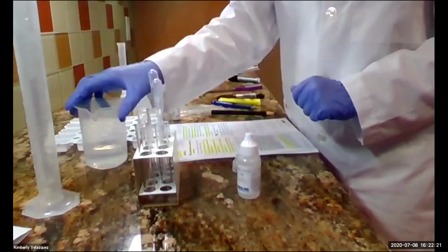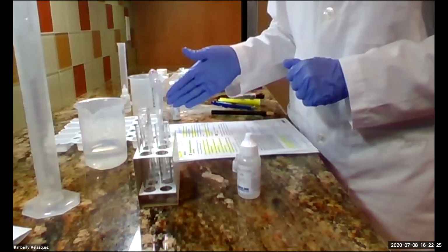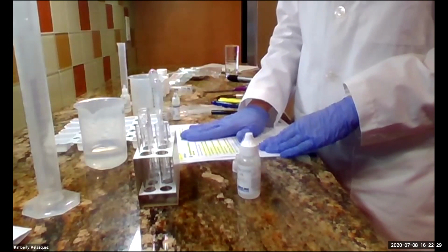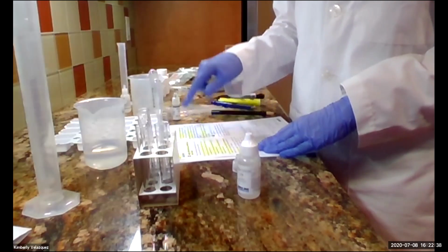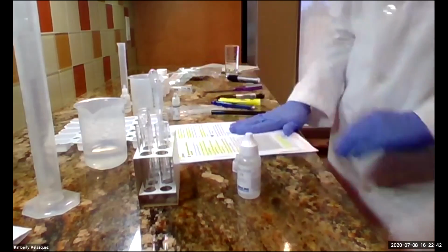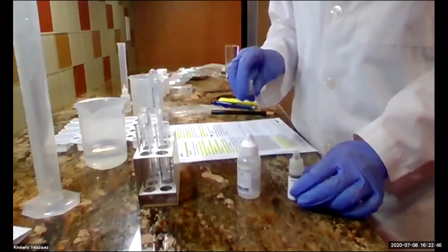Okay, if you have any questions, please contact me. Again, I'm not going to take you through every step of the experiment because that fun is for you, but really the prep this week takes a lot of time, so be prepared for that. If you end up needing extra time for activity 3 because you don't have a straw, then you could submit your results for 1 and 2 and just save your chemicals and do 3 later. Really for 3, you just need the pH indicator and some water.